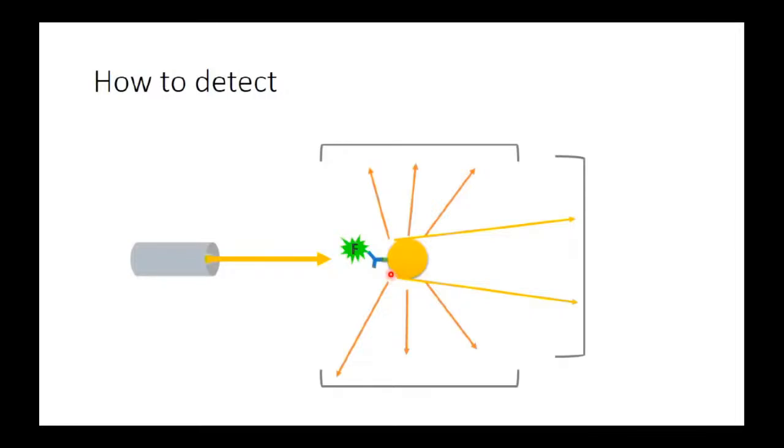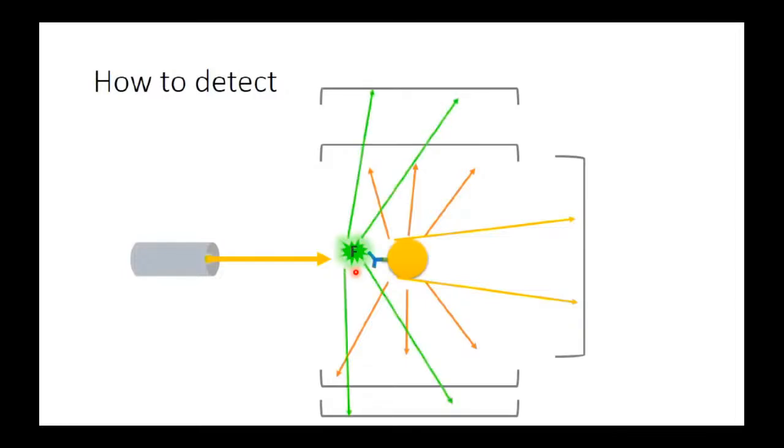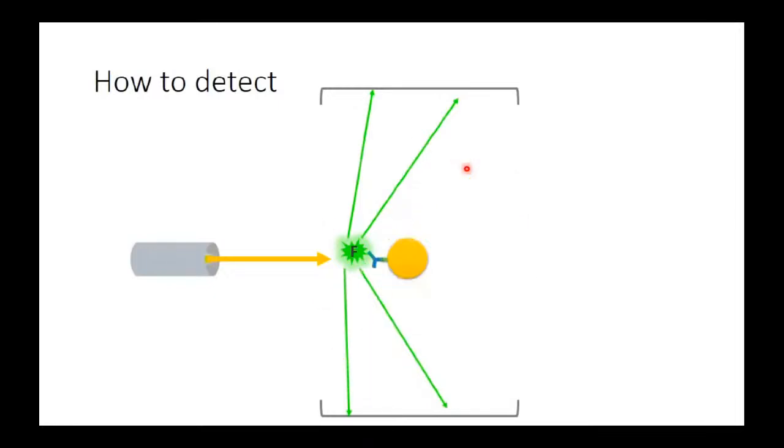And then when the fluorophore passes through the laser beam, the fluorophore will be excited, and then it will emit light at a particular wavelength, and this light will be detected by the fluorophore detectors. All these detectors are connected to the computer, which is going to give me the exact data about every event of these three.